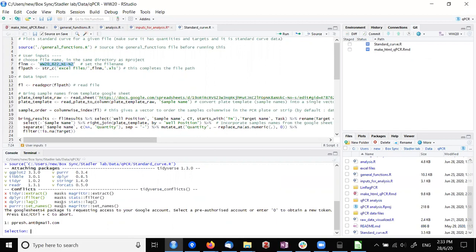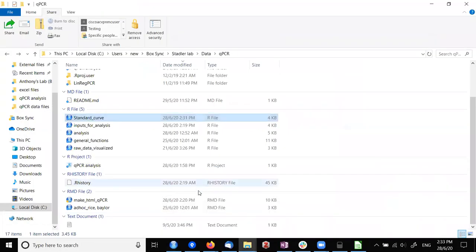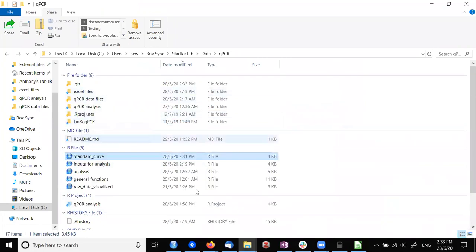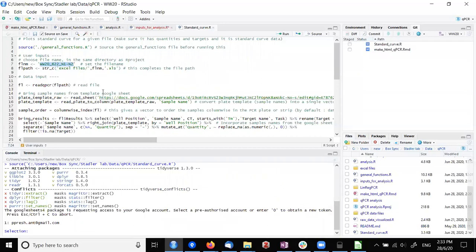So okay, just so I'm understanding, there's like a big folder with our project basically that the program starts in, and that's how it finds the relative folders, based on where they are relative to that. Okay. Yeah, that's how it is set up.